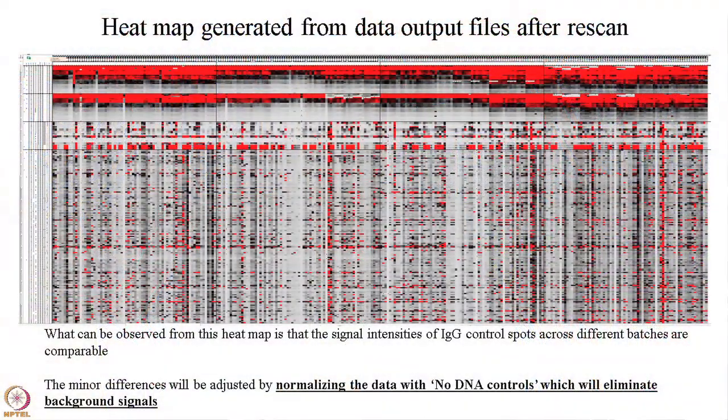After rescanning all slides, the signal intensities look more uniform overall, though batch 2 set 1 is still slightly higher than the rest. This remaining variation will be corrected by normalization, so we proceed with normalization using Excel.